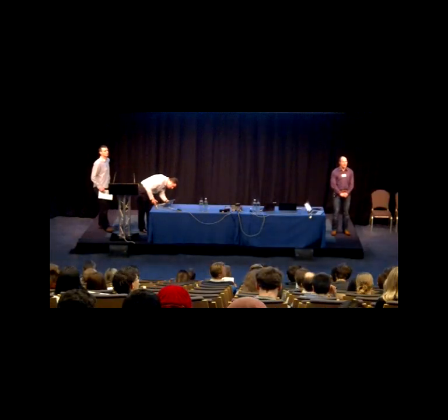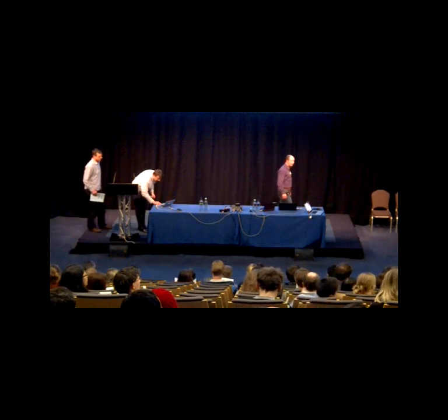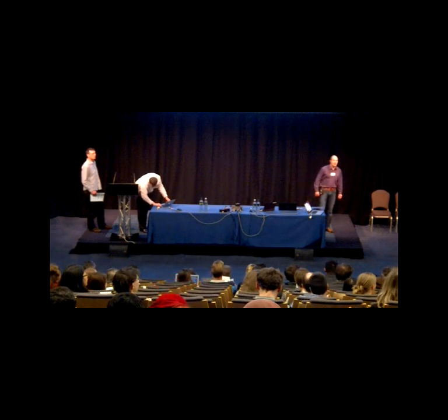Okay. I wanted to ask about the conformational thing that Giovanna mentioned, which was an explorer where you can generate different models with different angles. Is that no longer relevant with more sensitive detection techniques with smaller models now, or is that something that's worth putting into your decisions? Yeah, definitely. That is certainly a good one to do. I think Phaser used to have such a functionality, but I think it's no longer present. But we could definitely reinstate it. So, good. Then it's easy.